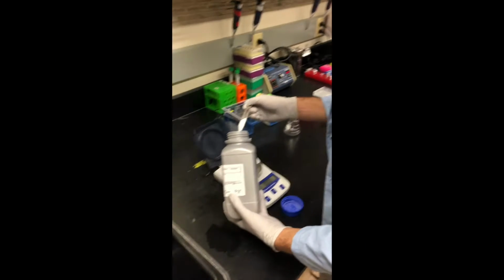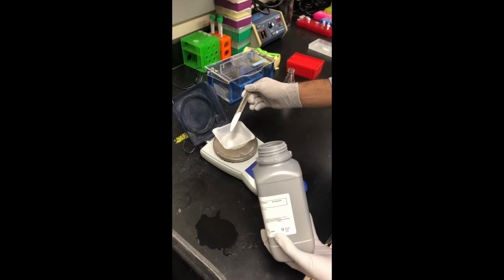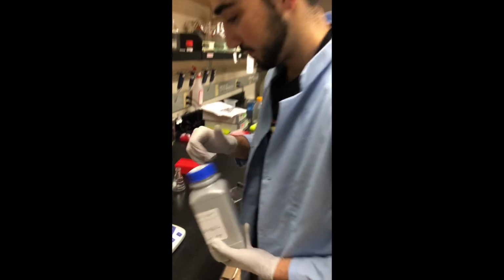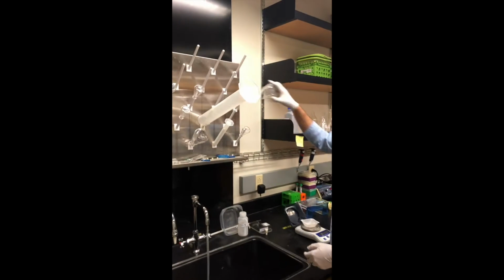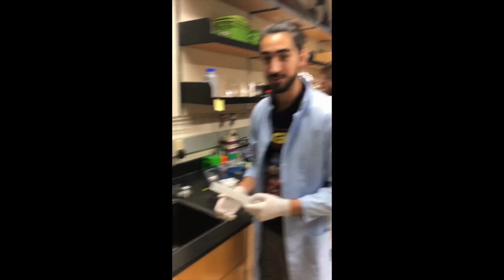Alright, so we're going to want 0.375 grams of it. And I kind of nailed it, to be honest, so perfect. Now, we're going to combine that with 25 milliliters of TAE, which is in this big jug right here. So we're going to need a flask, and a graduated cylinder to measure out our 25 milliliters.